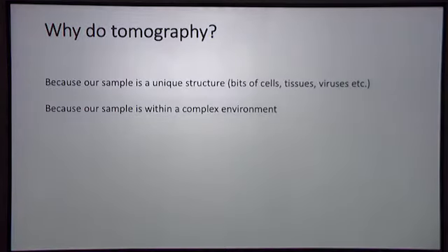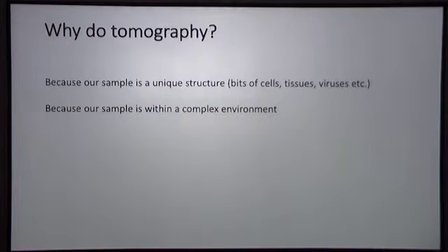So why do we want to do tomography? There are, I think, basically two main reasons. The first one is if our sample is a unique structure. If the thing we want to look at in 3 dimensions is a bit of a cell, a bit of a tissue, then we can't average many copies of that together because that's a unique object. So if we want a 3D reconstruction, we have to do tomography.